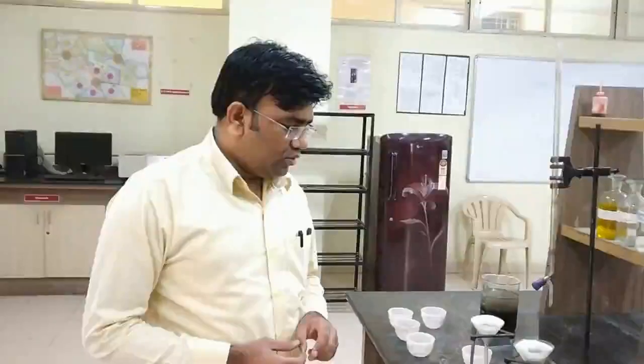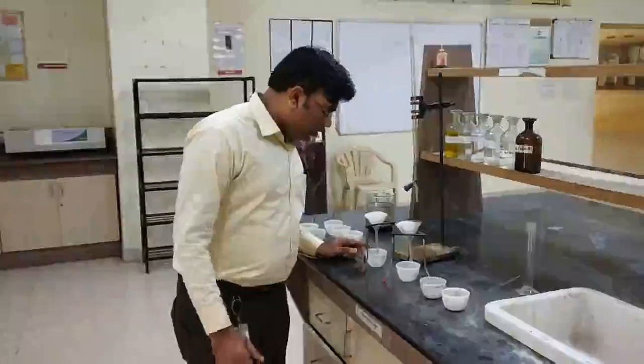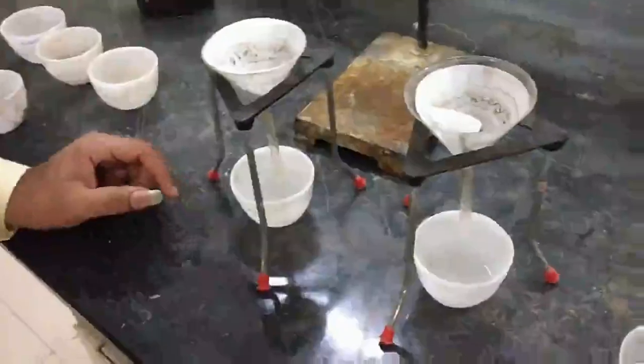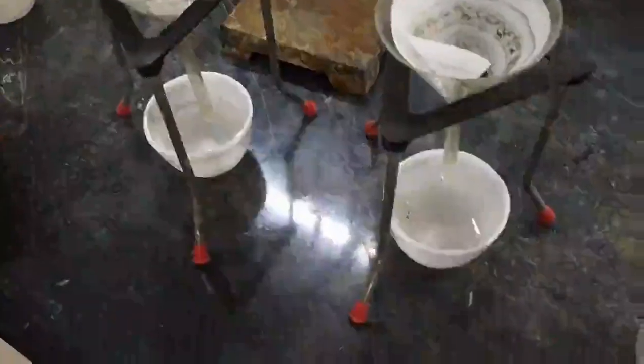Okay, so we have finished with the filtration process. If you see, the sample that we have put has now completely filtered into crucibles C and D.